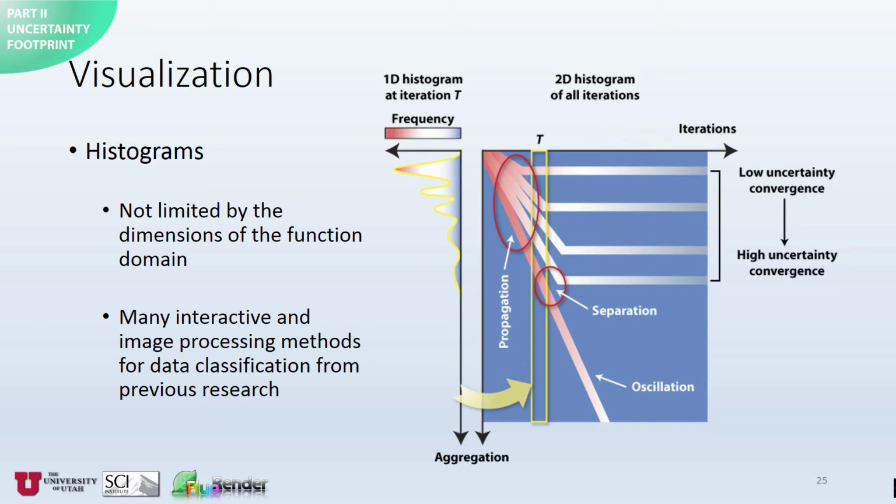Different regions of the domain may stabilize with different aggregated value changes. These are shown as horizontal lines with different heights. If a value doesn't converge, its diagonal line will continue. When lines separate, we know that divergent behavior might be isolated. It leads us to examine the areas with potential problems.